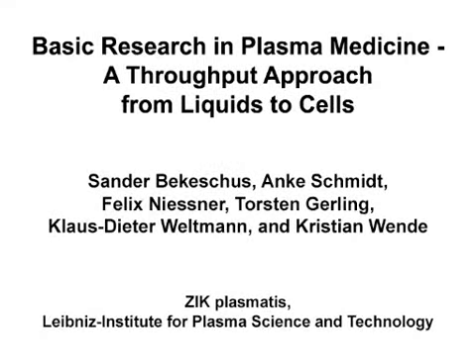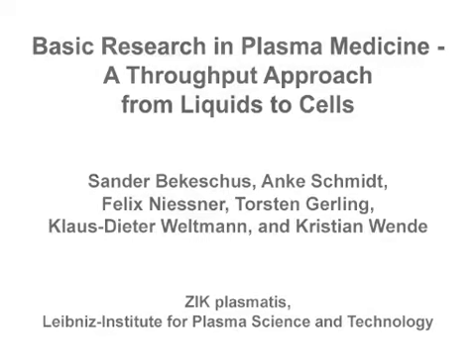The overall goal of these multi-well-based sequence assays is to better understand the effects of cold physical plasma-derived oxidants on biological responses in vitro, using optical emission spectroscopy, liquid analysis, and cellular activity, microscopy, and flow cytometry assays. This method can help to answer key questions in the field of plasma medicine, especially with regard to plasma-derived reactive species important for the induction of immunogenic cancer cell death.